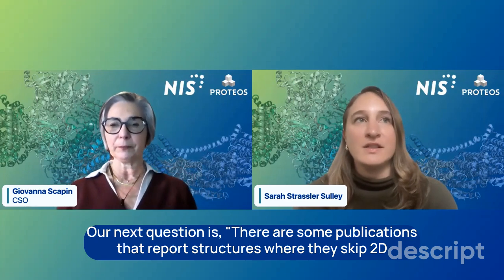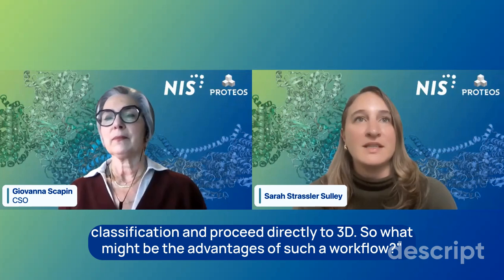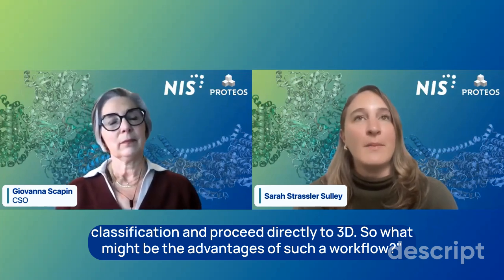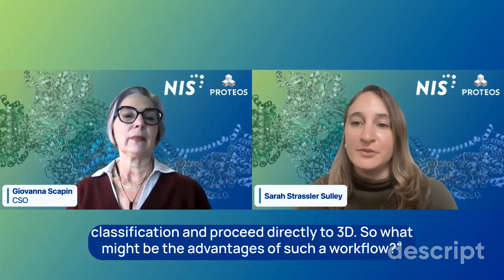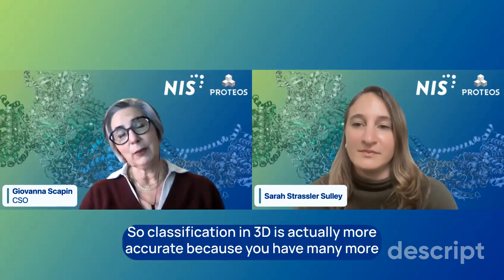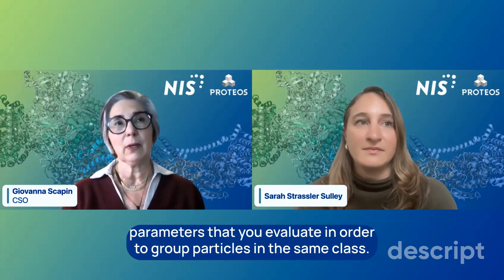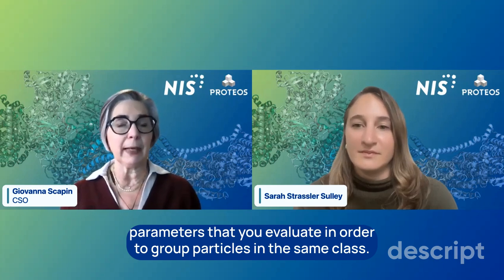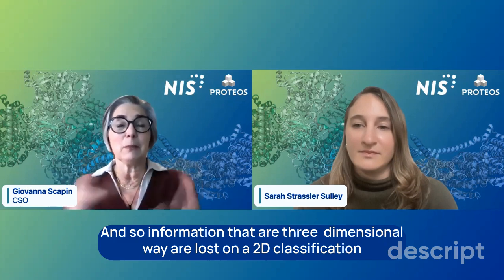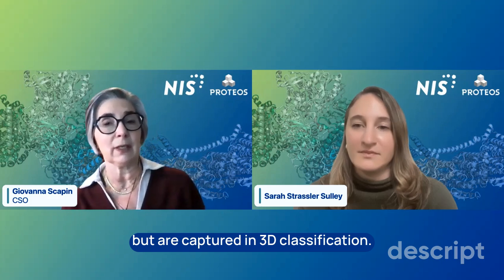Our next question is, there are some publications that report structures where they skip 2D classification and proceed directly to 3D. So what might be the advantages of such a workflow? Classification in 3D is actually more accurate because you have many more parameters that you evaluate in order to group particles in the same class. And so information that is three-dimensional is lost in 2D classification, but is captured in 3D classification.